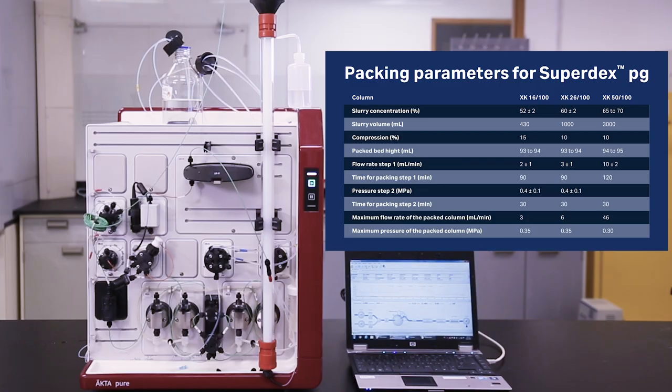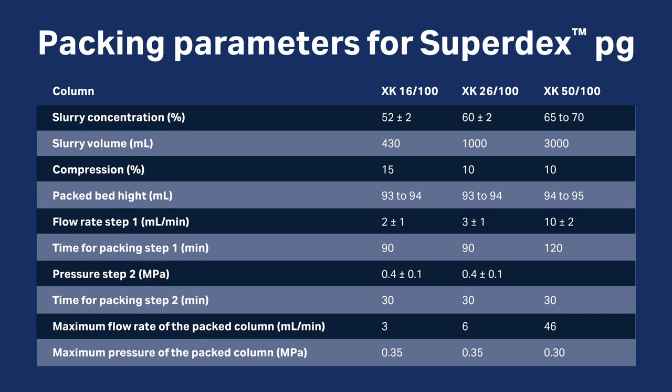Start the pump at a flow rate that is recommended for your resin. Different flow rates are used for packing different resins. Some resins are packed in two phases. Please check the packing instruction before starting the flow.